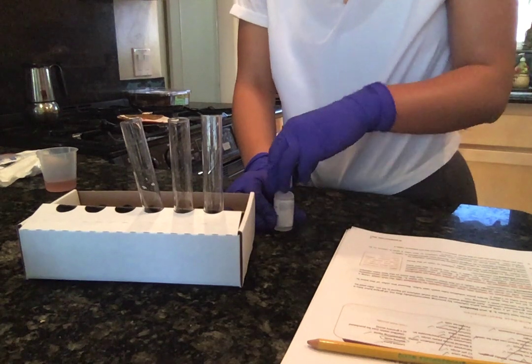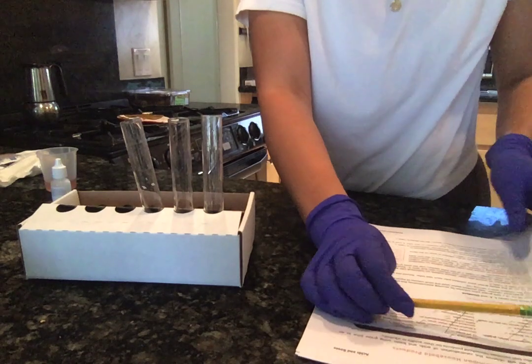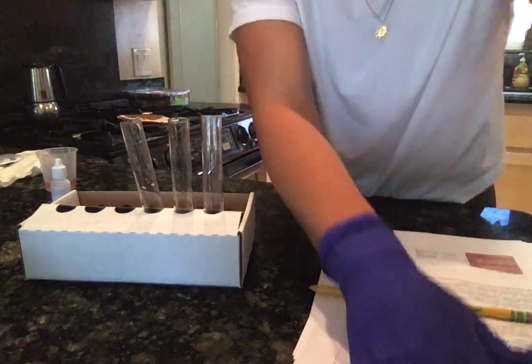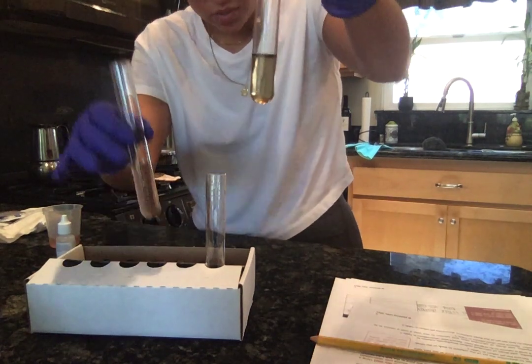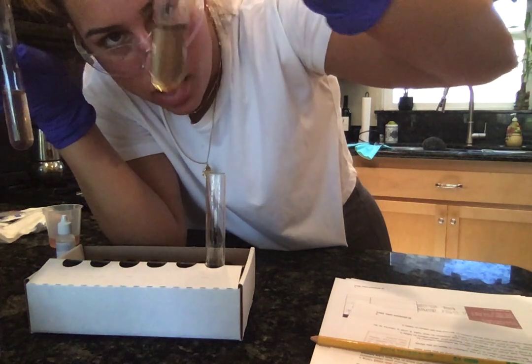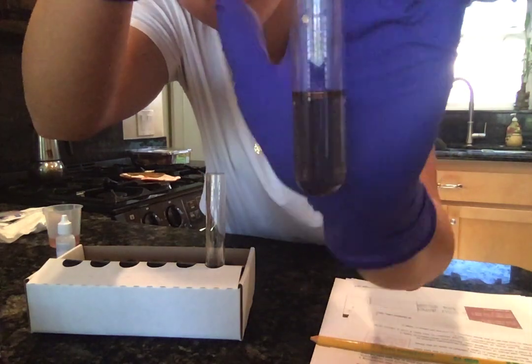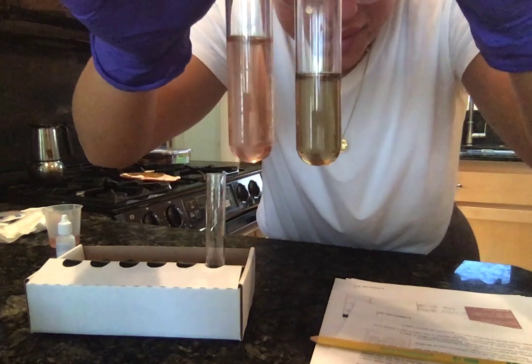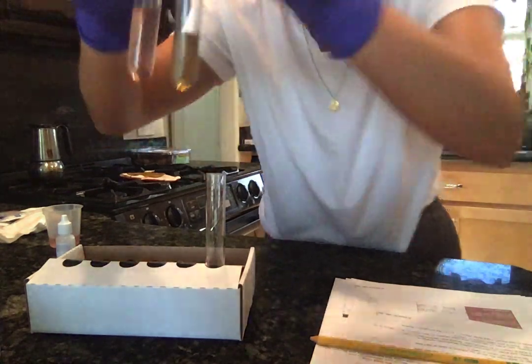Alrighty, so now we're going to record the observations concerning the color change in table two, and we're gonna go ahead and use the standard test tube just as kind of a comparison. So now this is my test tube two, and it looks pretty yellow brown kind of, if you can see. There, it looks dark. And then this is the standard. So there's a little bit more in here, but the standard is definitely more pink. In comparison, this one's yellowy. Okay.